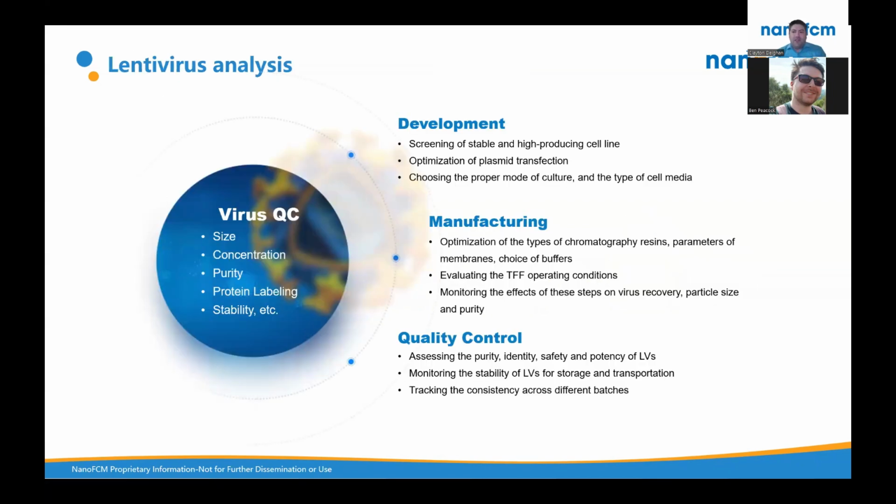And how does this lend itself into the virus QC? We're talking about the size of the particles. We're talking about the concentration in particles per mL of the particles.